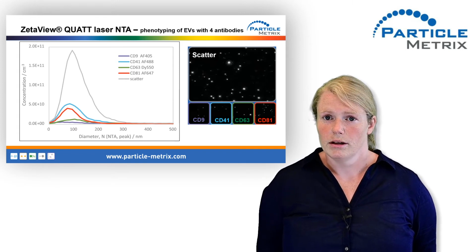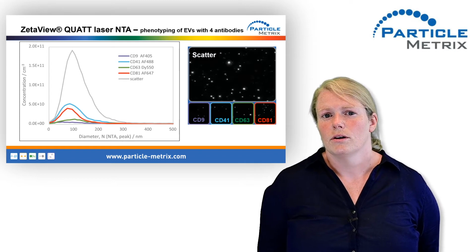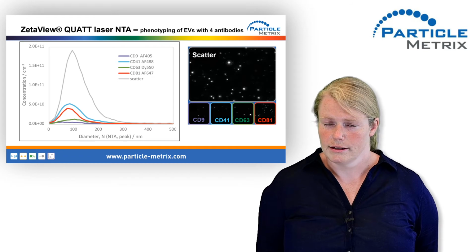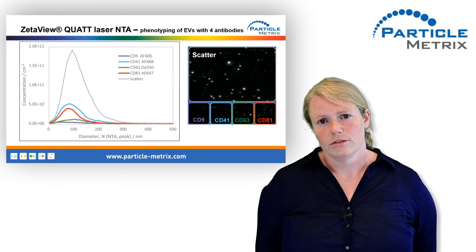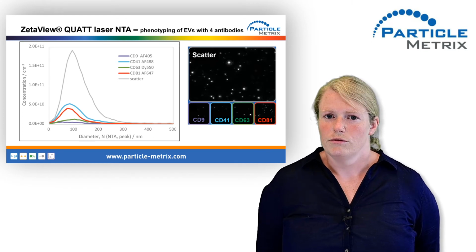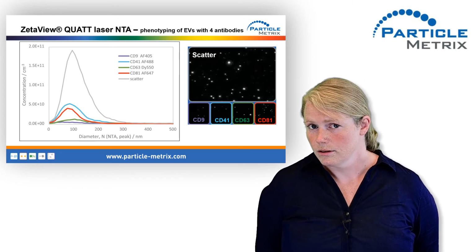As you might remember, this was part of the title of this talk. So the question is, do I need the quad to do multifluorescent NTA? Good news, the answer is no. Even if you have only 1 laser, you can do multifluorescence. But how does this work?